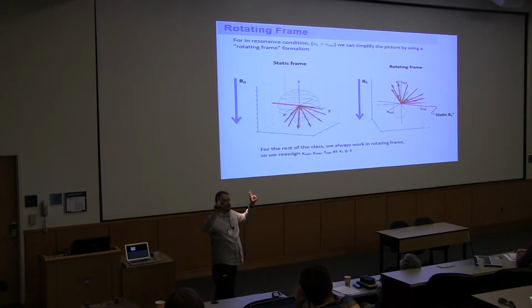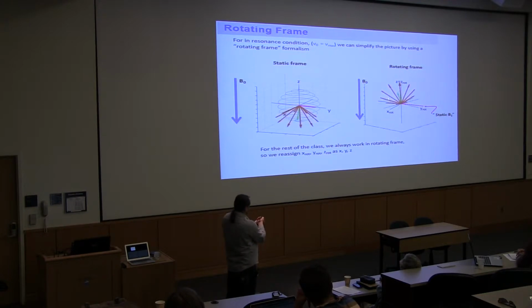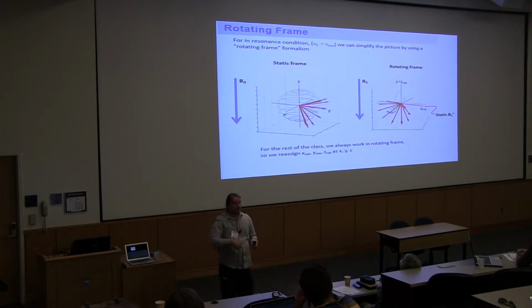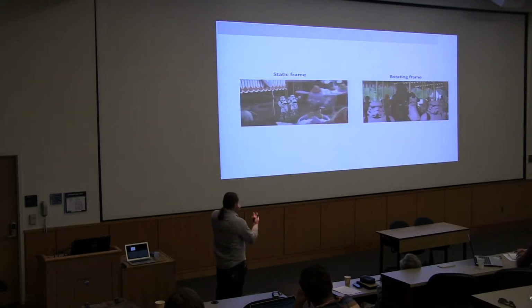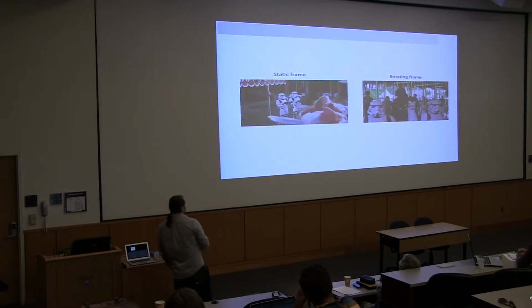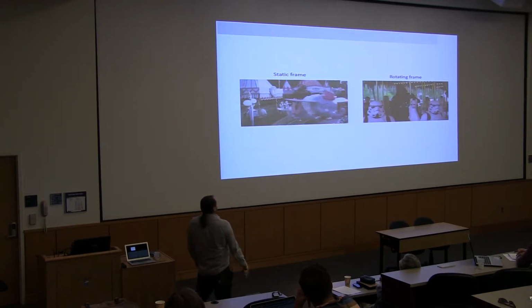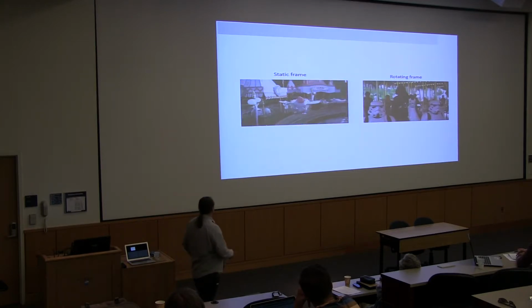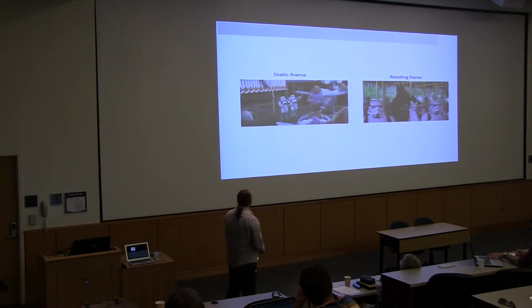So we have a static magnetic field from the microwave, and our magnetization will be precessing in the plane orthogonal to that field. To make it a little bit more simple, it looks like this. All right? This is our static frame. Everything just moving around jolly well. And in the rotating frame, we'll go along and just see what happens inside the carousel. Does it make sense? All right.